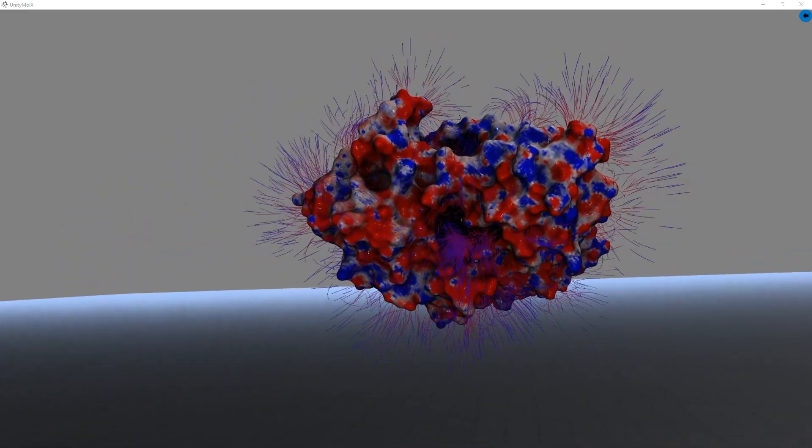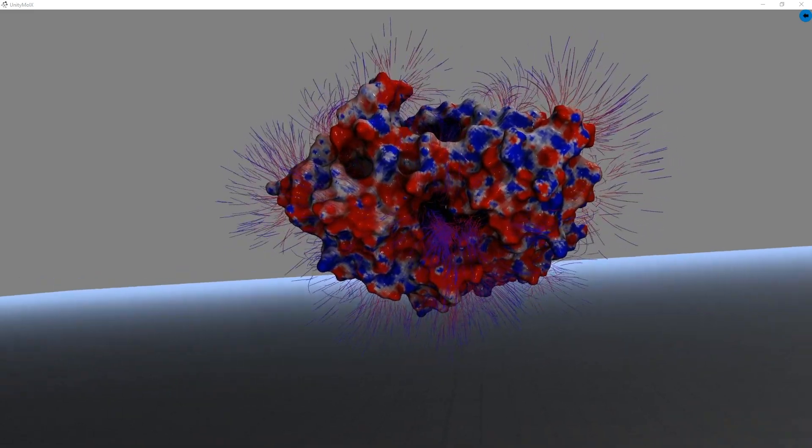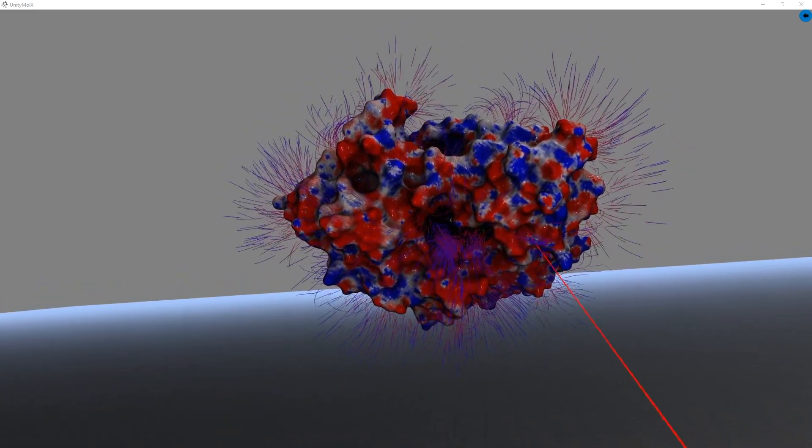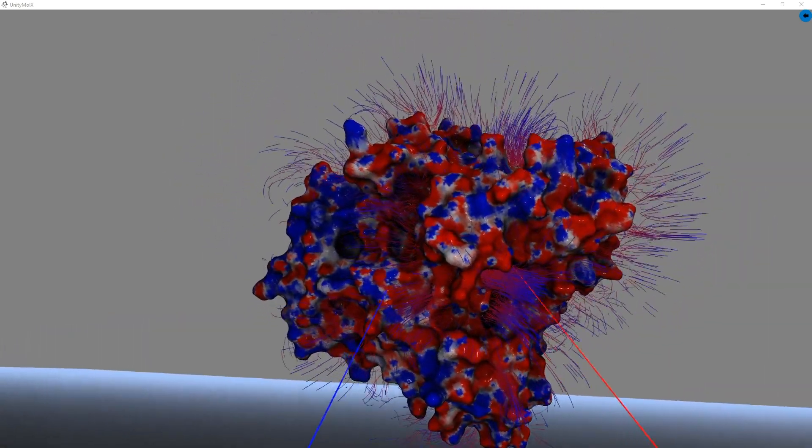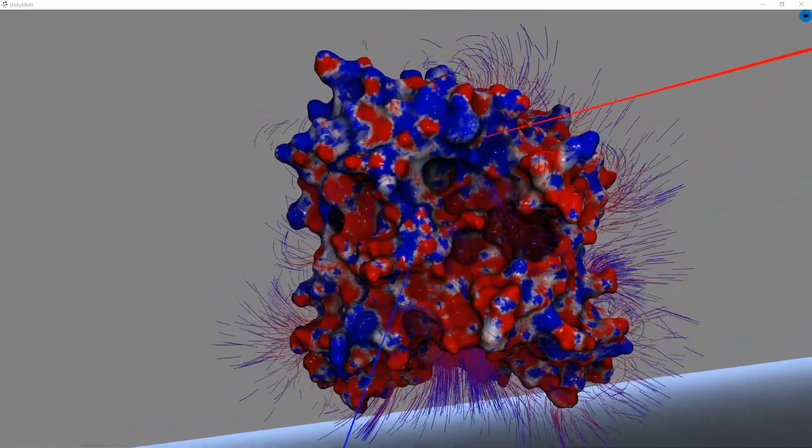Let's take a second to explore the outside of this enzyme and talk about how we arrived at this representation. We began by downloading the structure from the protein databank using PDB code 5EI5.